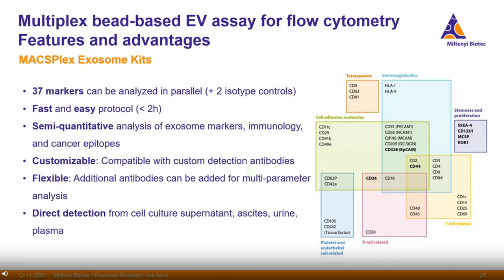After learning more about the basic principle of the Multiplex bead-based EV assay for flow cytometry and its features and advantages, let's have a closer look at some data.